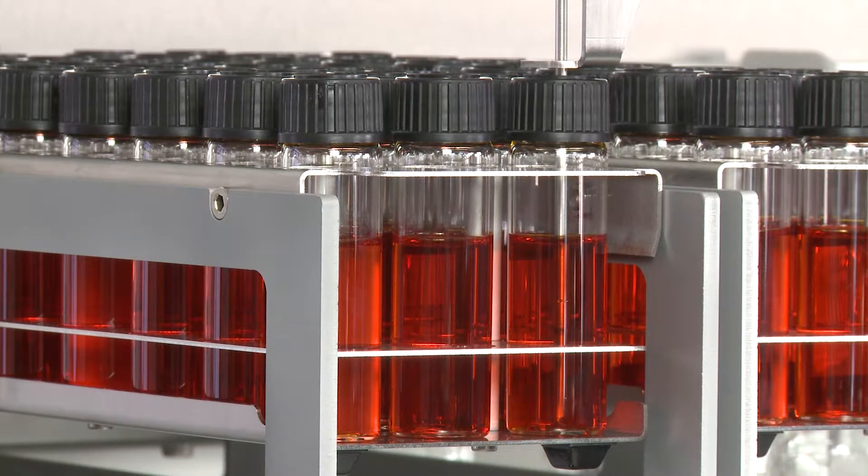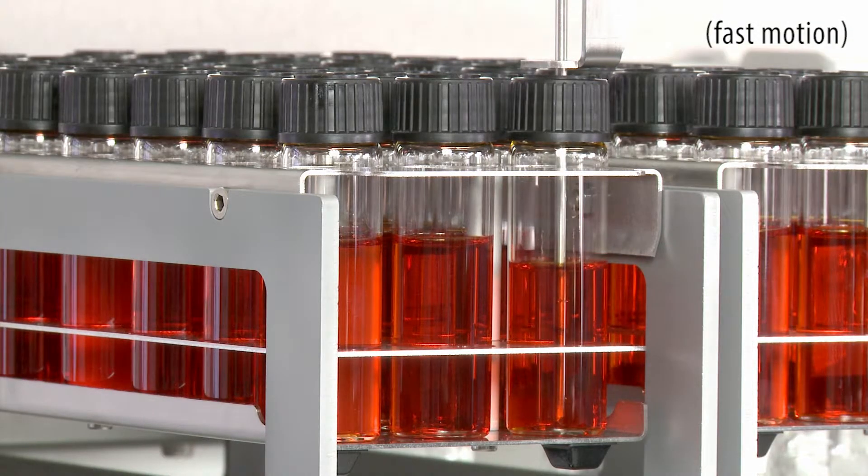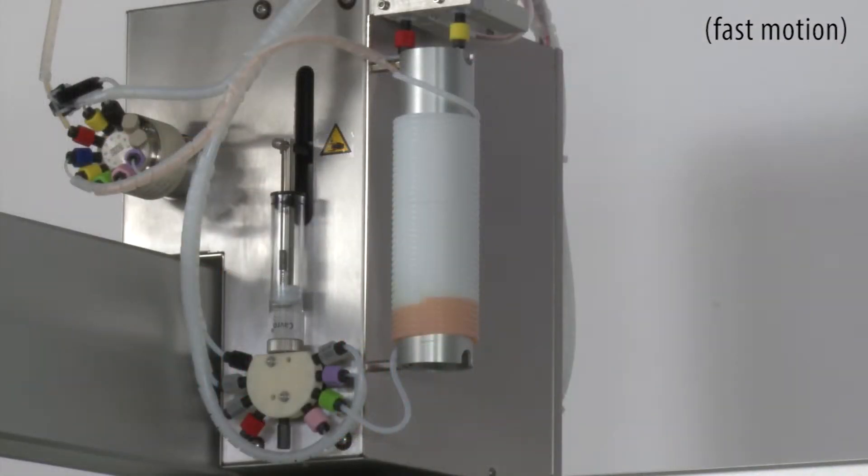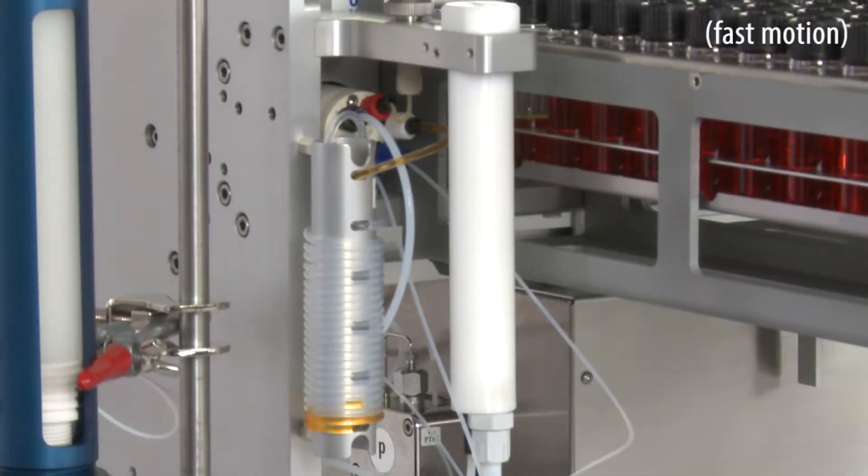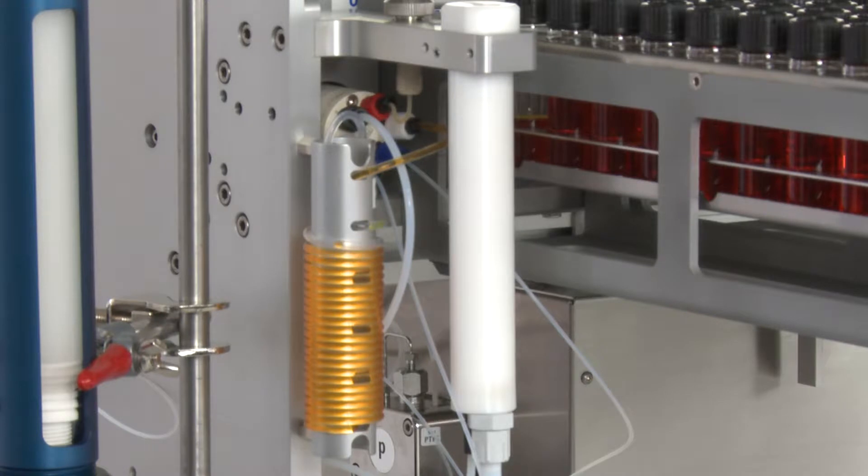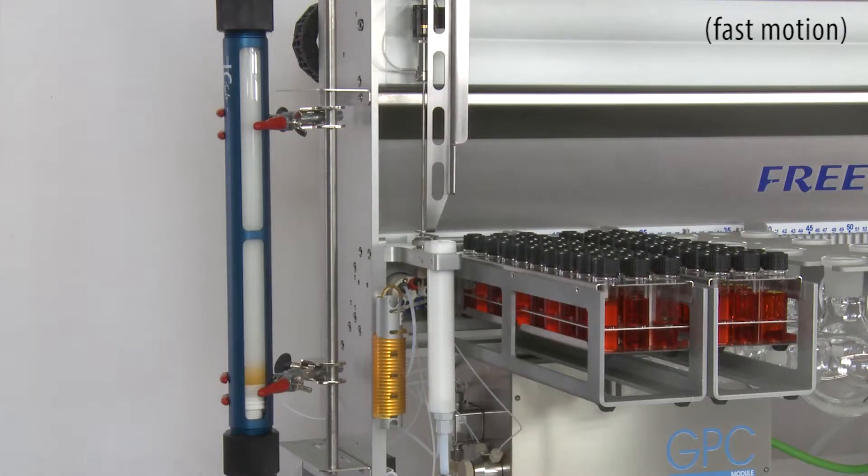The sample is taken up from a sealed container, fed into the needle loop, and injected into a calibrated sample loop. The injection valve is switched and the sample is put onto the GPC column.